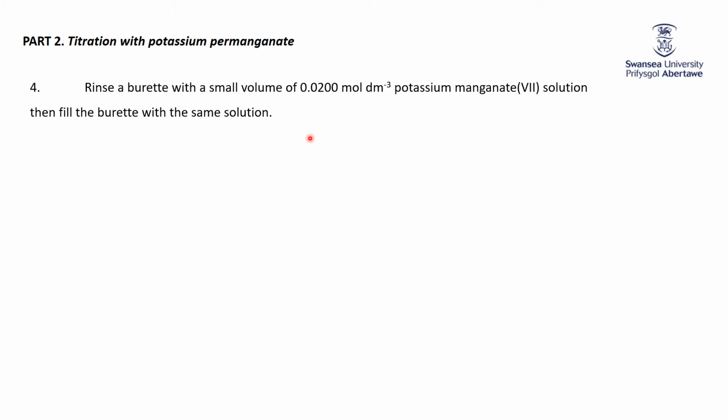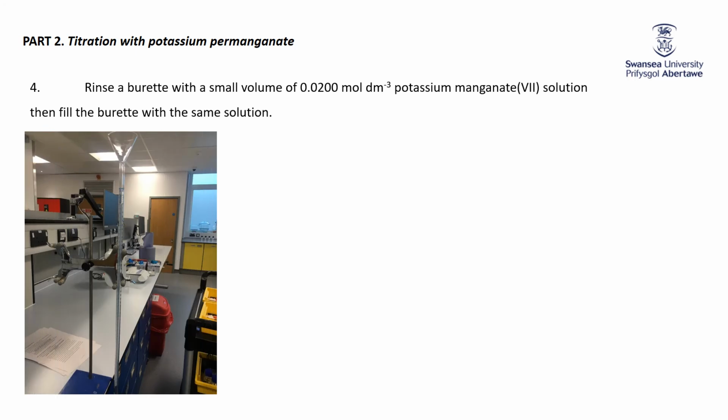Now again, a little bit of experimental technique to discuss here. A burette is this long glass cylinder here. And when you have a fairly high bench like we do in our lab, and I'm sure some of you do, the top of the burette can be about 7 feet above floor level. When you fill a burette, you need to put a funnel in there. But if you're not tall enough to be able to reach and pour into that funnel, so that, as you will see in a minute, the funnel is below your eyes, you need to lower it until it is.